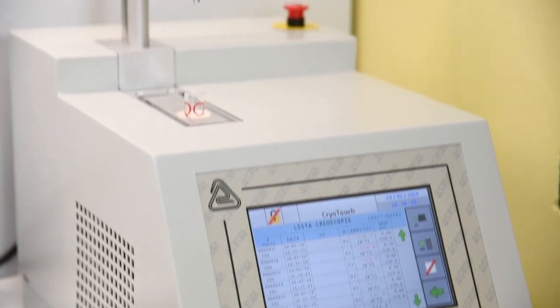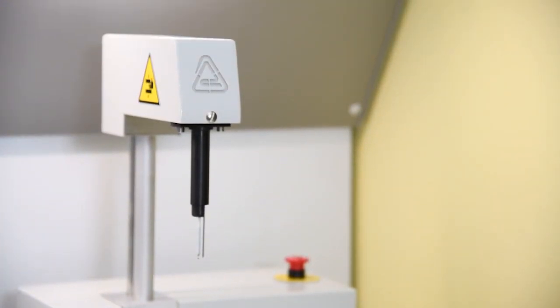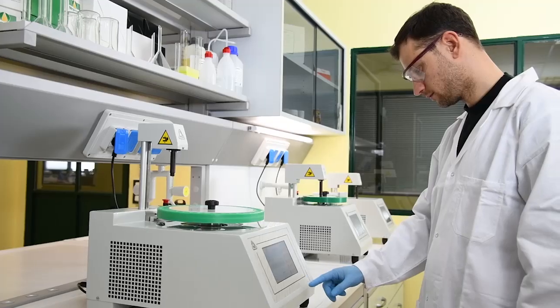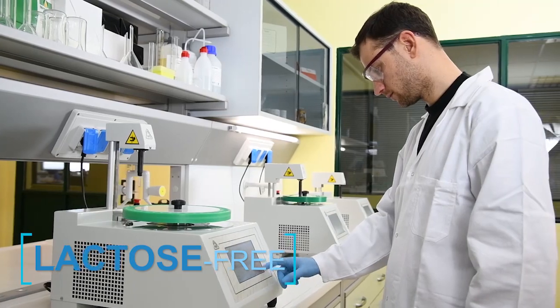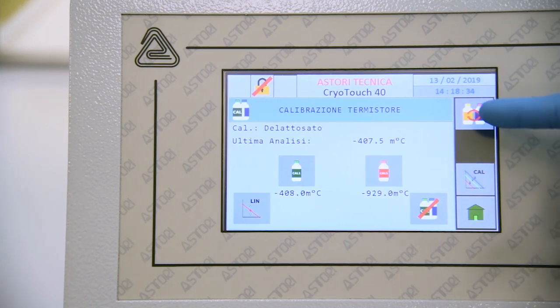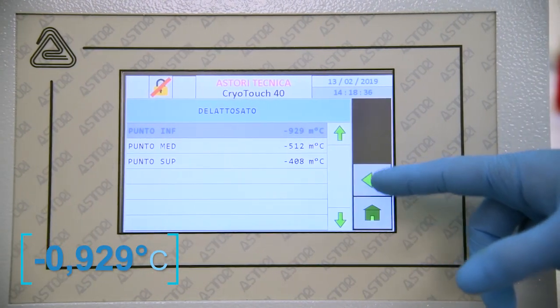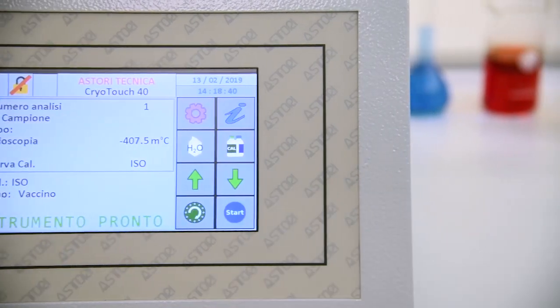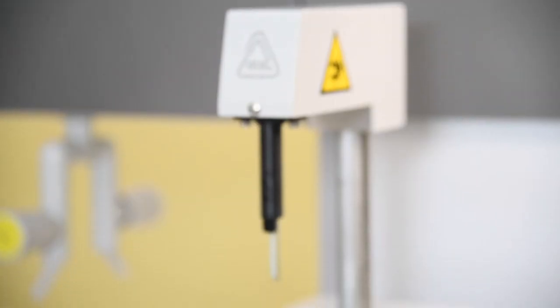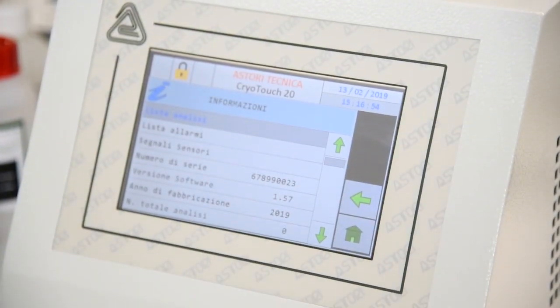The firmware allows to memorize reference values for six different milk species or other samples, such as cream or whey. It can also store two different calibrations, the ISO curve and the one for correct analysis of lactose-free samples. The lactose-free function enables calibration of CryoTouch unit and analysis of delactose samples in a temperature range down to minus 0.929 degrees Celsius, meanwhile granting very accurate and repeatable results, even with lactose-free samples, and confirming the successful delactose-ation treatment. CryoTouch cryoscopes are ready to operate after only five minutes from switching on.